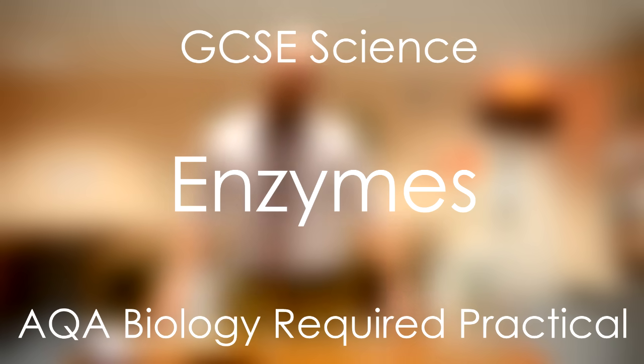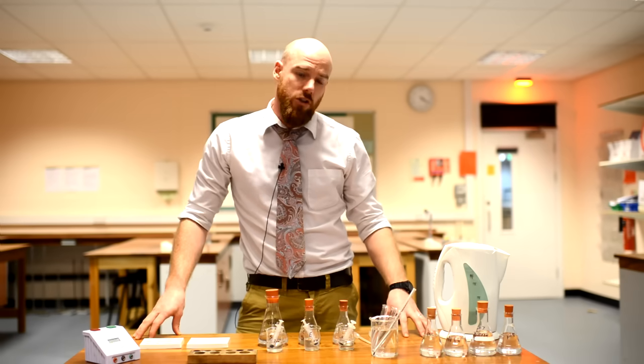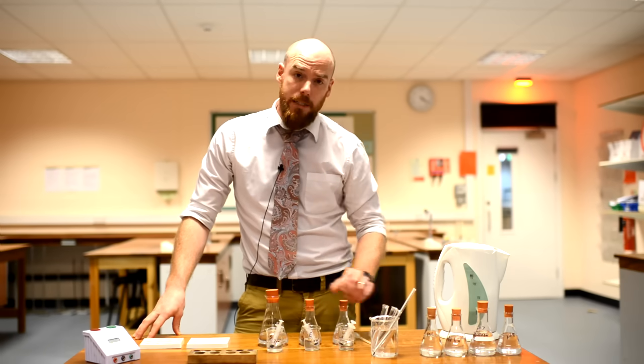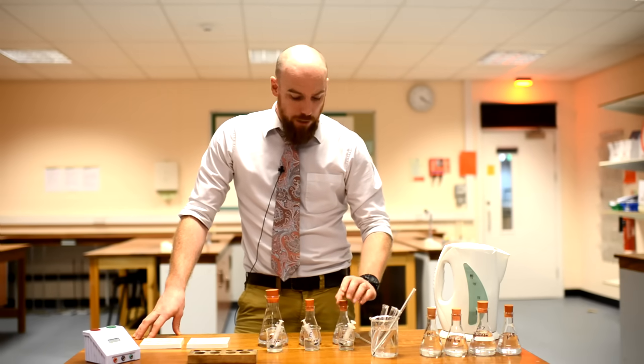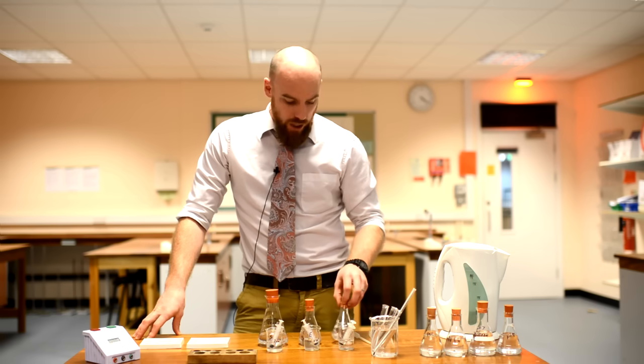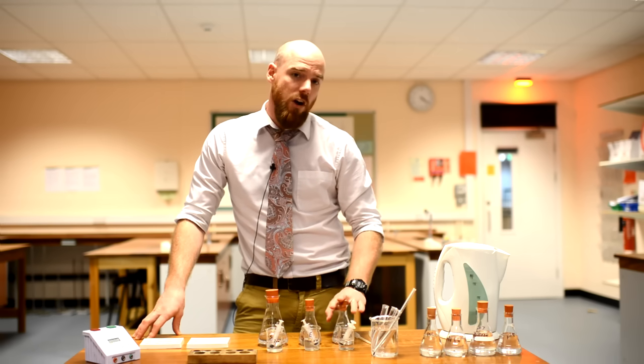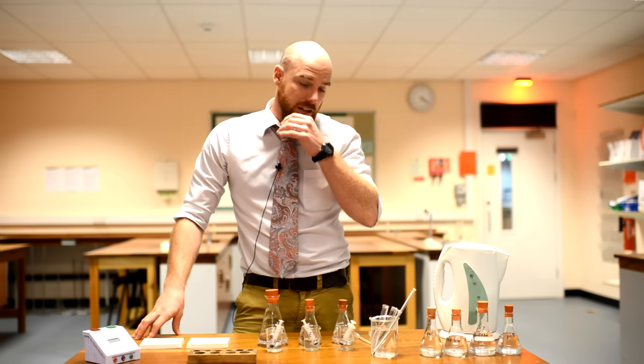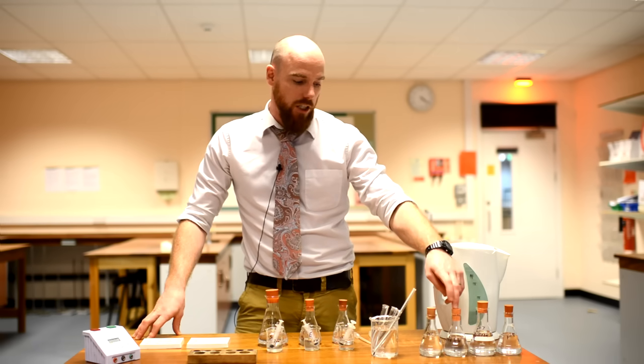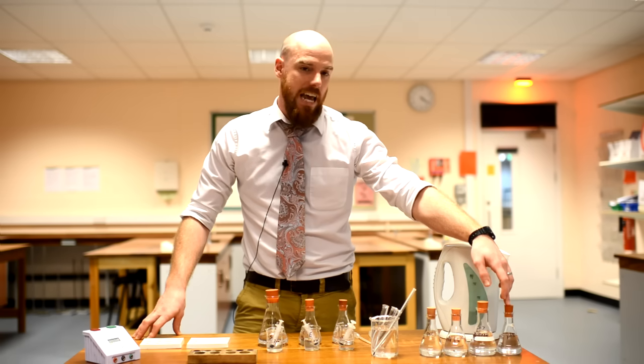Today we're looking at the digestion of starch solution into sugar solution using the enzyme amylase. I will demonstrate this practical to you using a buffer solution of pH 5 and you will repeat the practical at pH 6, 6.4, 7 and 8.